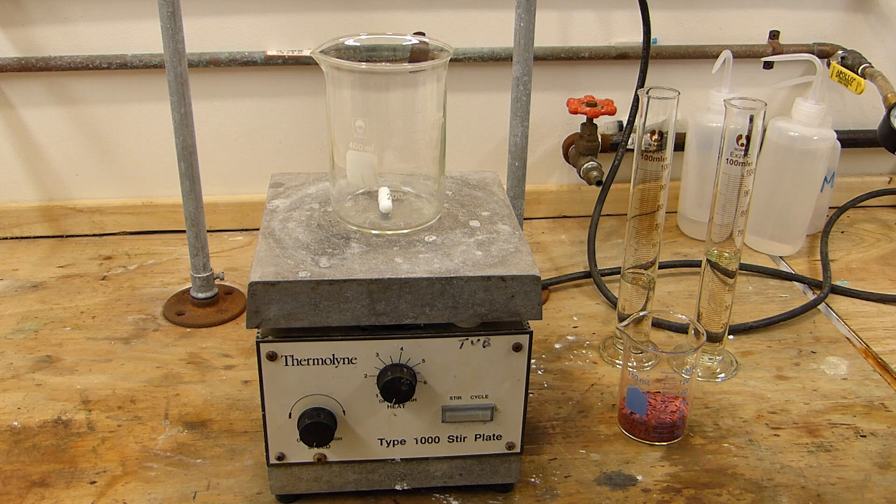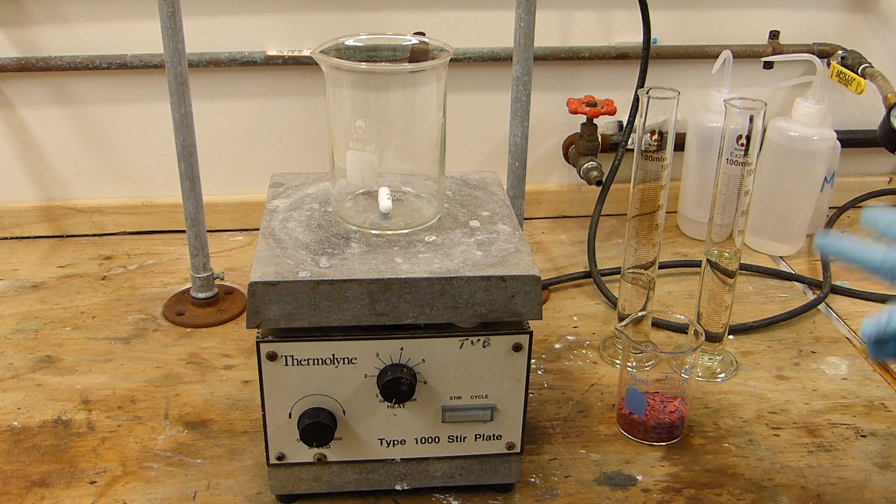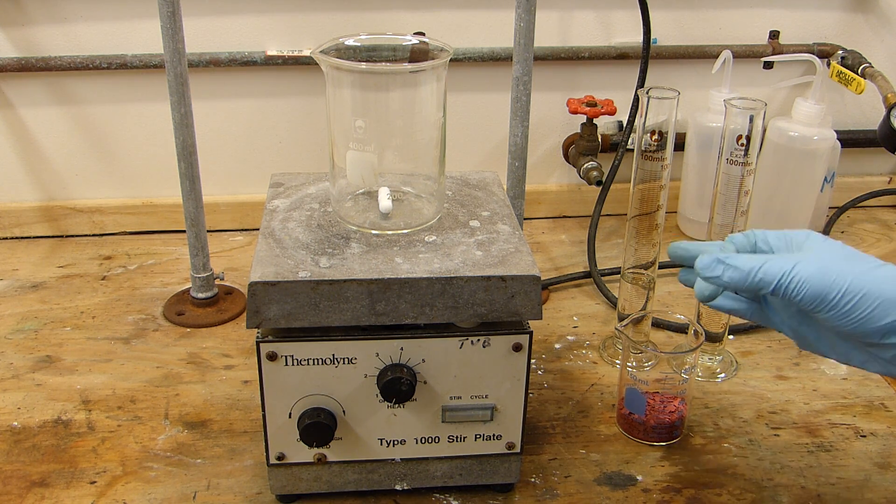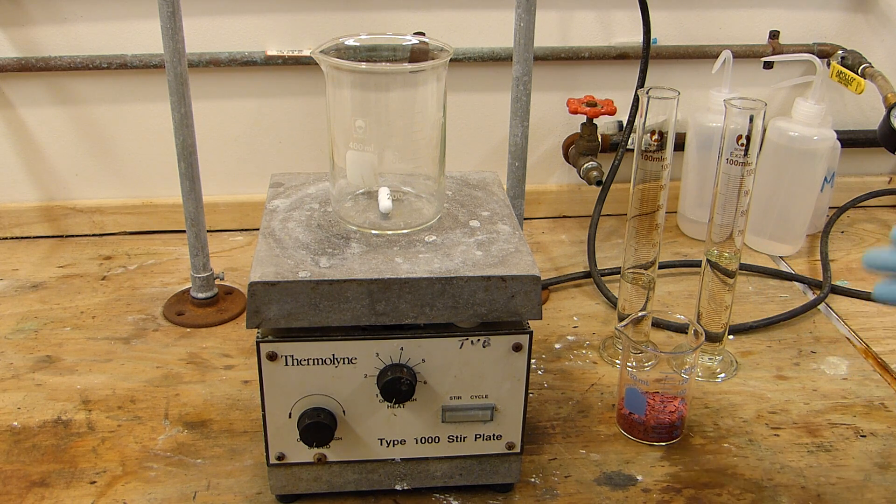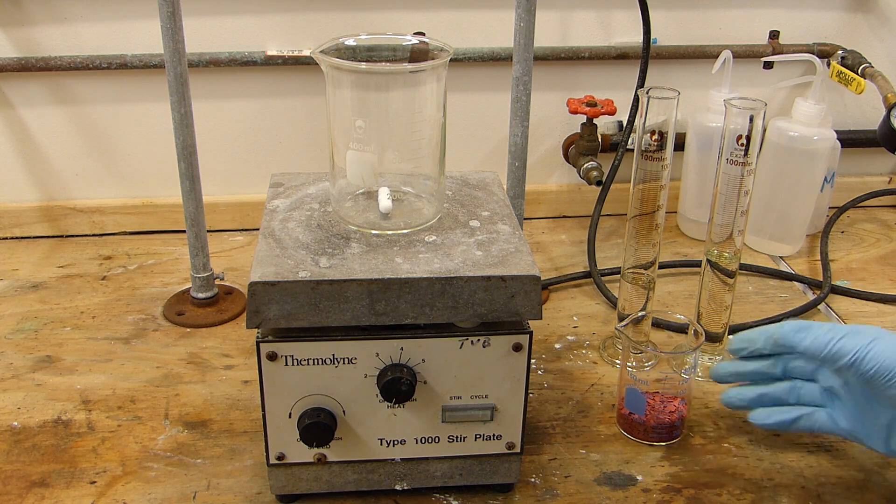To begin we'll prepare the solution of chlorochromic acid by mixing hydrochloric acid and some chromium trioxide. Now I have hydrochloric acid but it's a little too concentrated for this application so I've got enough water here to dilute it down to six molar and that'll be a total of 184 milliliters of six molar HCl when those two are mixed together.